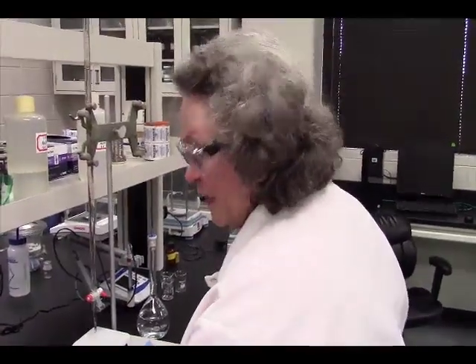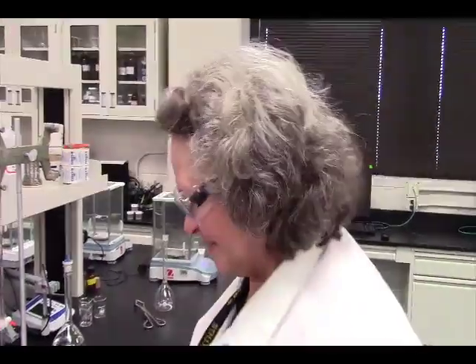All right. We're going to titrate the rest of these, and then I will have the data in Canvas for you to work up to do all of your calculations. But we're going to come back to the last titration so you can actually see how we're going to do a titration after we have a known quantity of our titrant that we're supposed to add. So I'll see you in a few minutes.